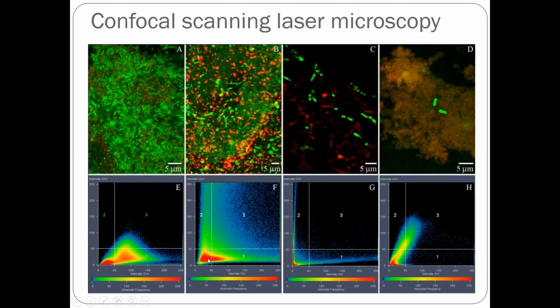Then in the color spectrum corresponding to that, we see the y-axis start to show up, which means the color starts to become red. The third picture is the one where we used chlorine. We see more red cells because most of them are dead. And the last one is where we used chlorine with surfactants. You will see only two colonies still survive. Most of them are a brownish color, which means they are injured, and you can see the color spectrum is right in the middle. So using the laser confocal microscope, we can see live and dead cells of biofilm on food contact surfaces.